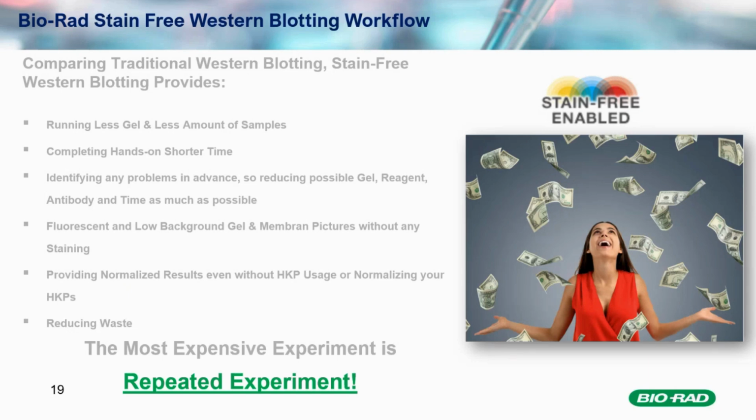On the other hand, we also try to have some excess volume, like 10, 20, 30%. But when we need to repeat the experiment, we double our budget, so it becomes the most expensive experiment in that case.